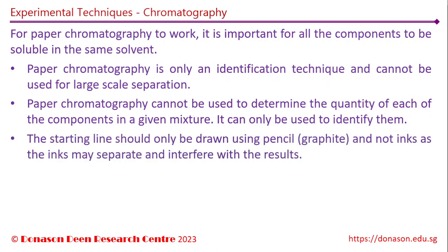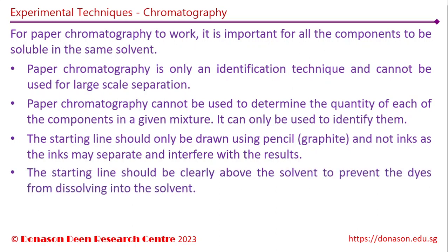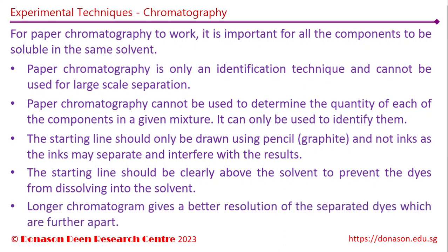The starting line should only be drawn using pencil or graphite. Inks cannot be used since the dyes in the ink may also separate, and this would interfere with the results. The starting line should be clearly above the solvent in order to prevent the dyes from dissolving directly into the solvent. In such a case, the dyes would not appear on the chromatogram correctly. A longer chromatogram gives a better resolution of the separated dyes, which would be further apart from each other. This would make it easier to identify the components or enable us to calculate the RF values much more accurately.